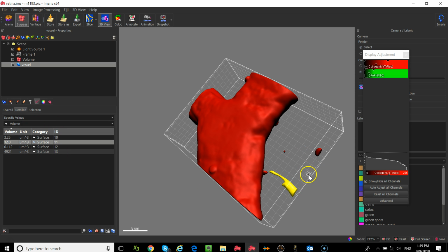If we select multiple objects, I'm going to hold the control key down. That will be the command key on a Mac, I think. You can try it. Will it let you select multiple? Is it command or control? Command. Okay. So you can select multiple objects.